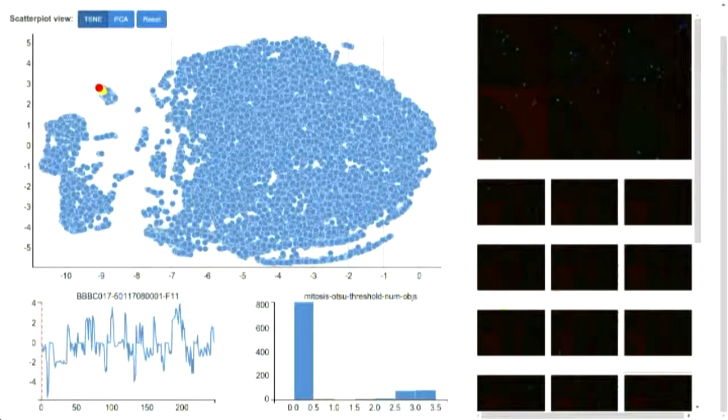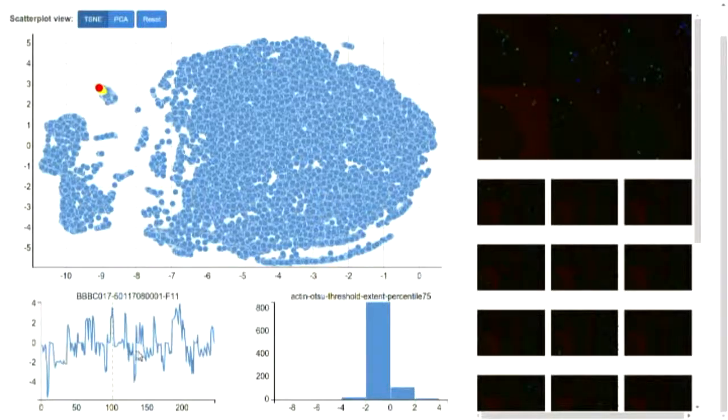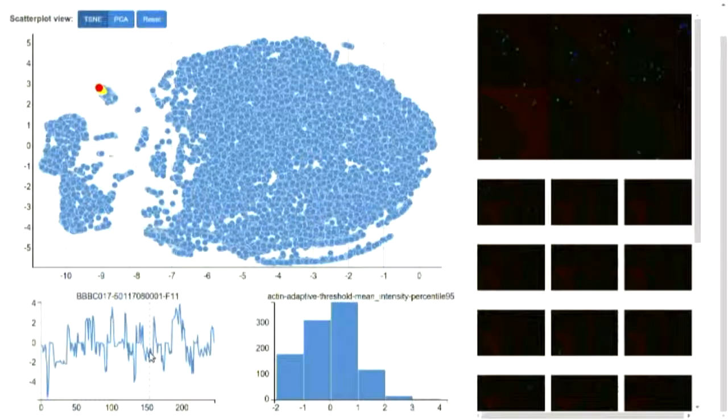You can see that's updating the scatterplot. Then on the bottom here, what I have is a line plot. This represents the standardized scores for that large, high-dimension feature vector that I was talking about. When I click on that line plot, I get a distribution of that particular feature of how it appears across the entire data set.